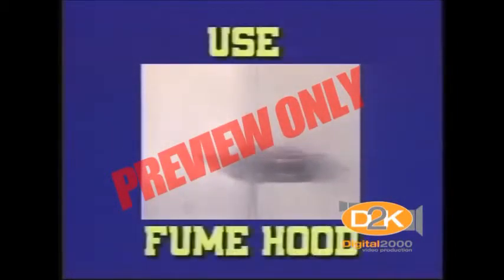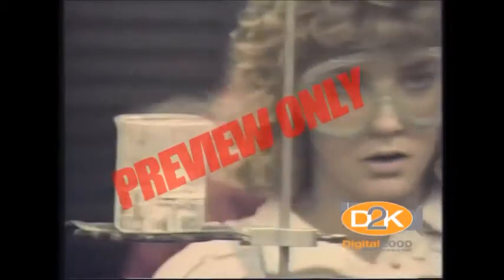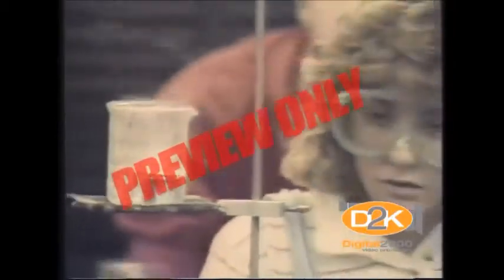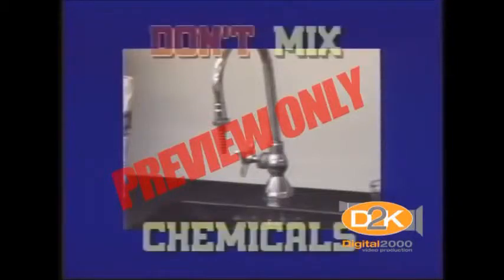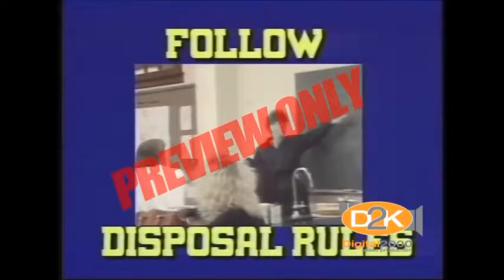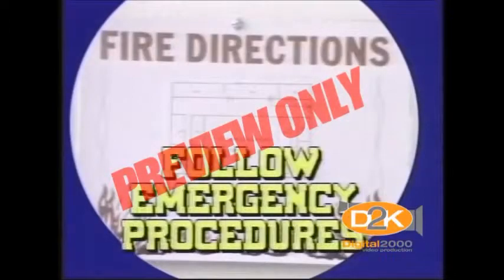Use fume hoods for volatile and hazardous chemicals, but of course never lean into the fume hood. Don't use the fume hood as a storage area. When personal protection is required, both the lab worker and lab partner must wear the protection. Don't mix chemicals in the sink drain. Always follow your teacher's instructions when disposing of chemicals. Pouring chemical waste down the drain can be extremely hazardous and violate environmental laws. And always follow emergency action procedures in the event of an emergency.